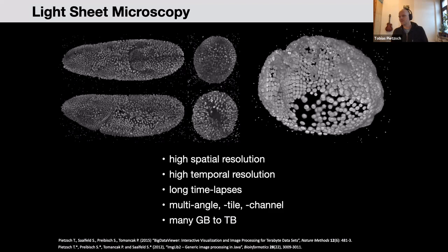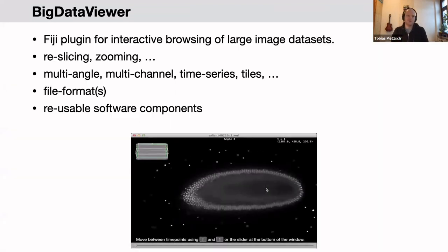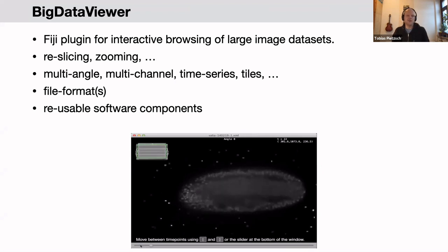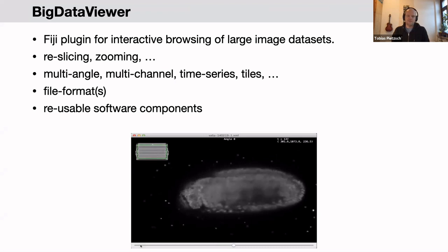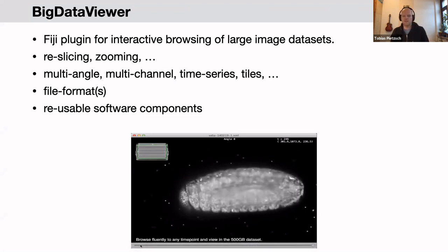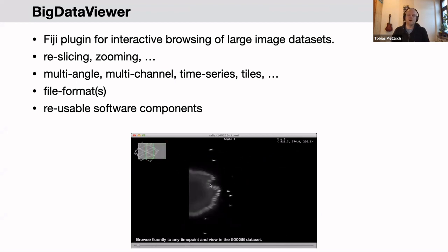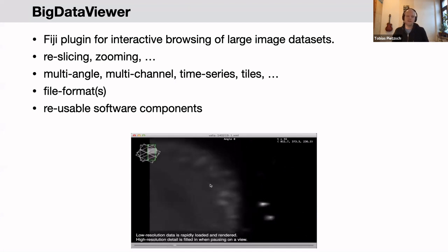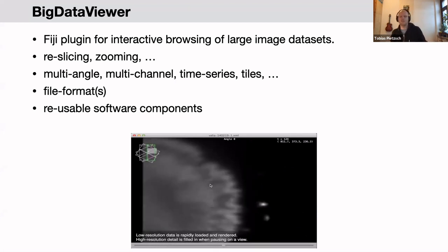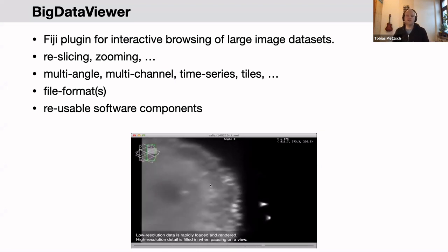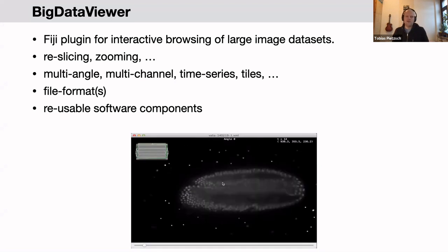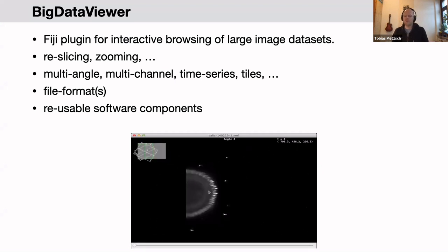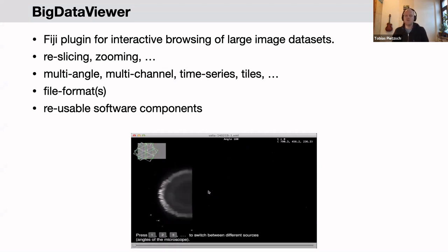Big Data Viewer is a Fiji plugin for interactively browsing such large image datasets, and has been used for datasets larger than 100 terabytes. It provides interactive free slicing and browsing of light sheet data, supports time points, channels, angles, and tiles, and registers all these different aspects into a common global coordinate system so you can view individual tiles and channels one by one or jointly combined.